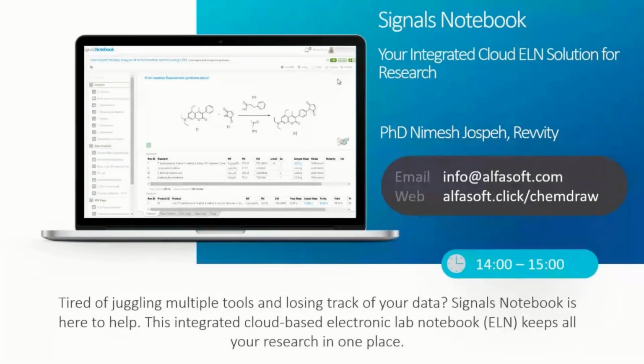Yes, indeed. So the Signals platform, which we call Signals Research Suite, is an end-to-end R&D workflow solution, and this provides data capture and collaboration, data processing, and data-driven analytics as well. Now, the Signals Notebook works as the central piece of capability to capture and organize the data for the make, test, and decide cycle. We have seamlessly integrated with Spotfire.